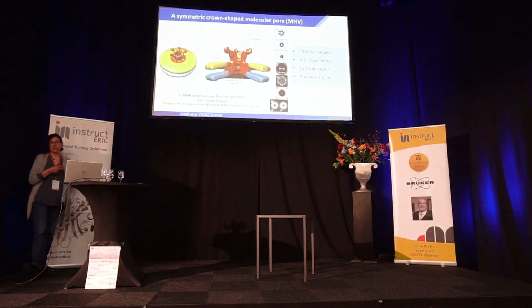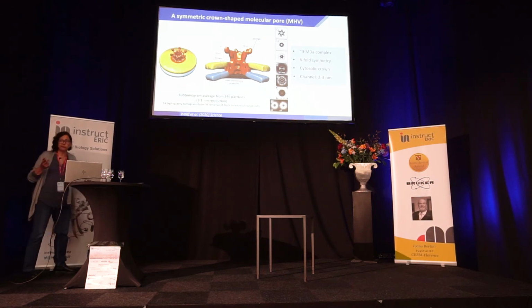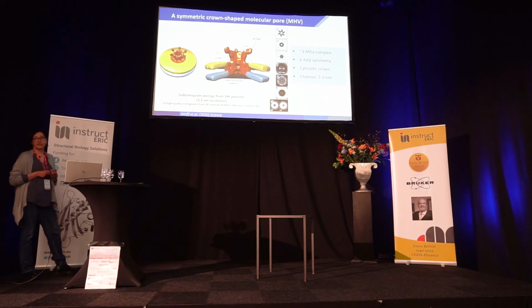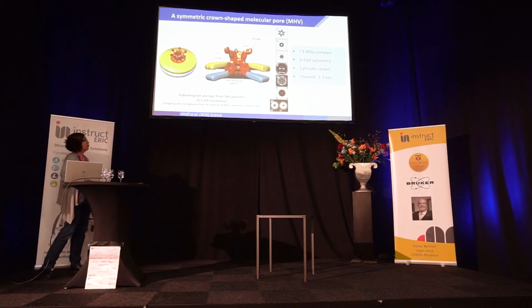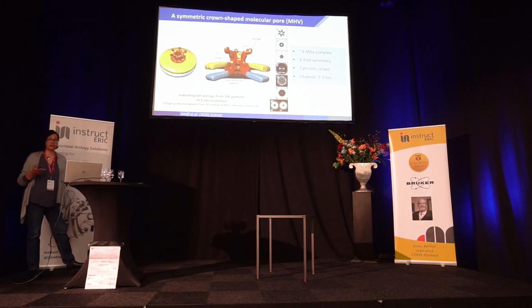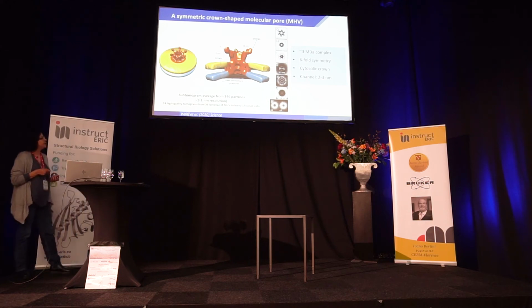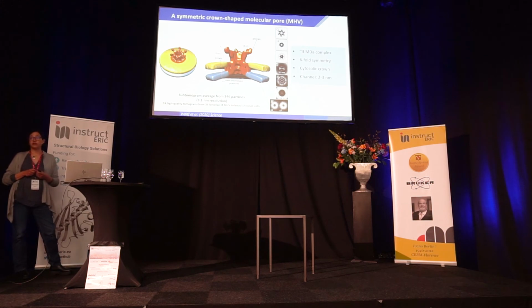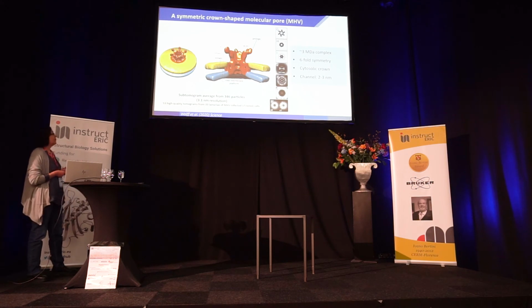We then applied the technique that has also been mentioned before, subtomogram averaging, and got a modest resolution for structural biology, 3 nanometers, but still this was good enough to give us some interesting information about the complex. It's a large complex, about 3 megadaltons. That's what we estimate; it's probably an overestimate because of the resolution. It has 6-fold symmetry and a beautiful cytosolic crown that you can see here, and there is a central channel that has some constriction points, but even at the narrowest, it's about 2 to 3 nanometers, which could be sufficient to export the RNA. So that's what we think it is, a viral RNA export channel.